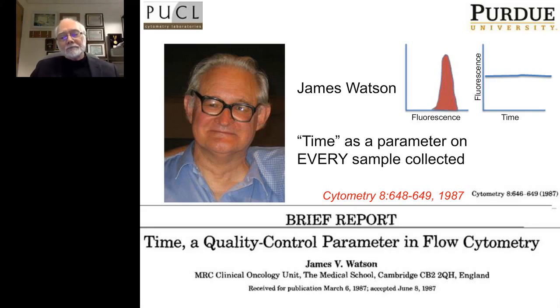Jim Watson, for those of you who don't remember, is past president of ISAC and a person who has had a very high reputation in the field of flow cytometry for many years. And in 1987, Jim published this paper that you can see here, Time as a Quality Control Parameter.